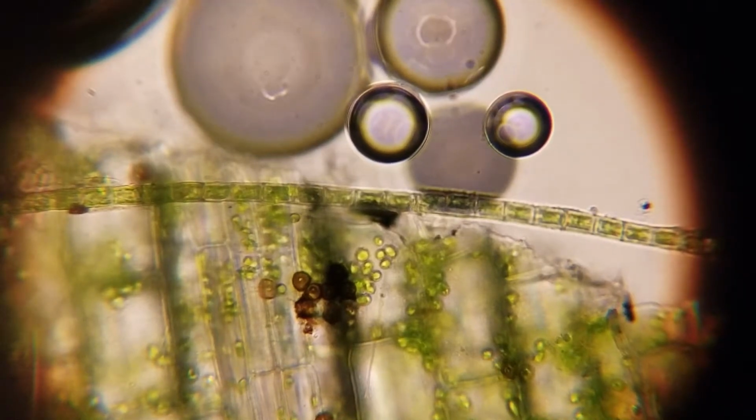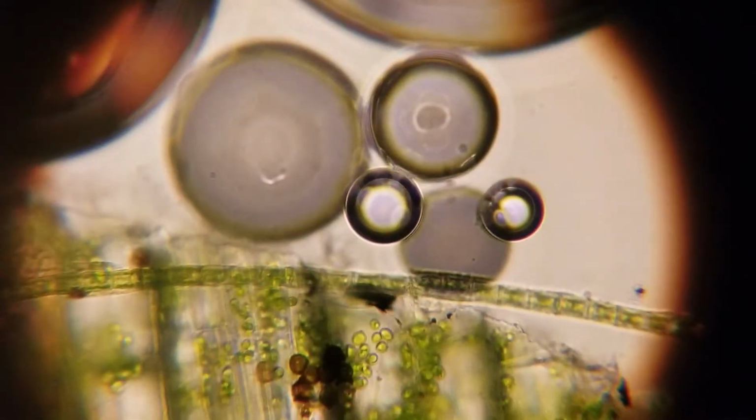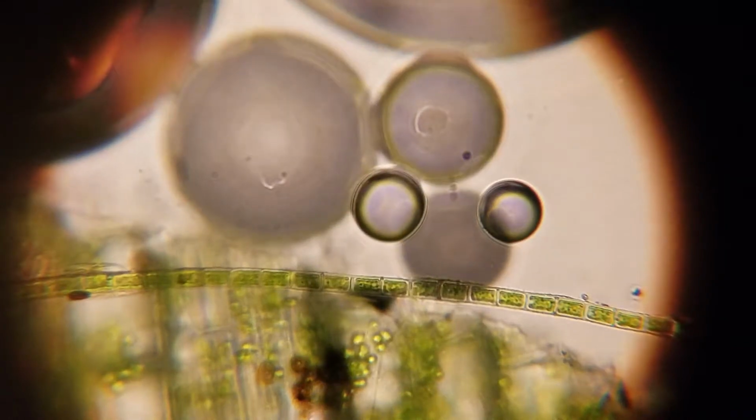Oh, there's a stalk of algae that went unseen. I never would have noticed that algae if we hadn't zoomed in more.